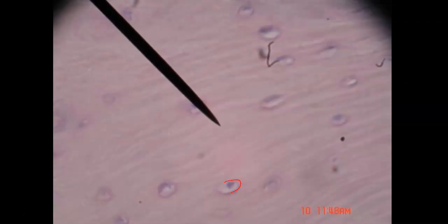Again, you can see the chondrocytes in the lacuna, but then you can see those dark pink lines, and that is a very dense network of collagen fibers. So those are the histological tissues of the skeletal system.